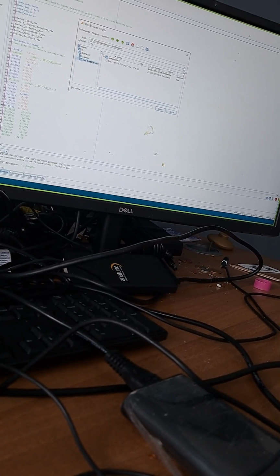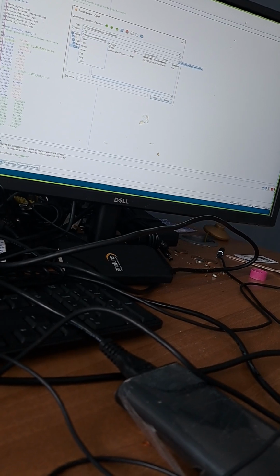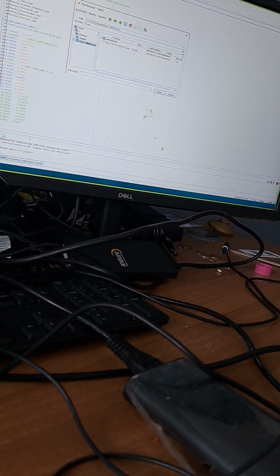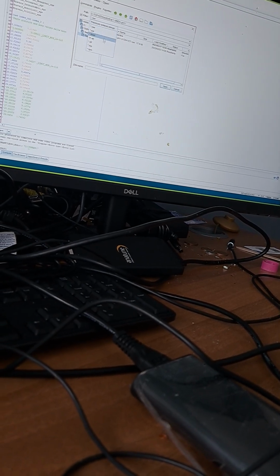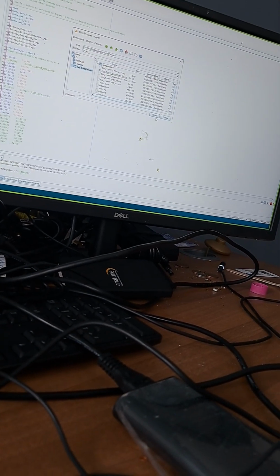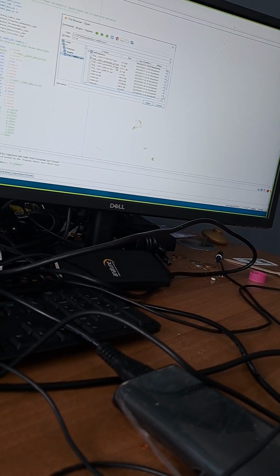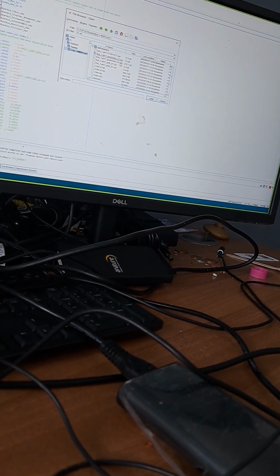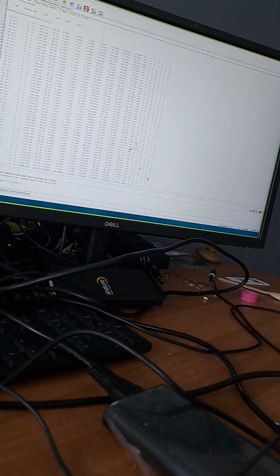That needs to be star. That needs to be the fourth one up. Okay, all the different types of characters. Fine. The one down from that. And ndx, peak index peak. Yeah.